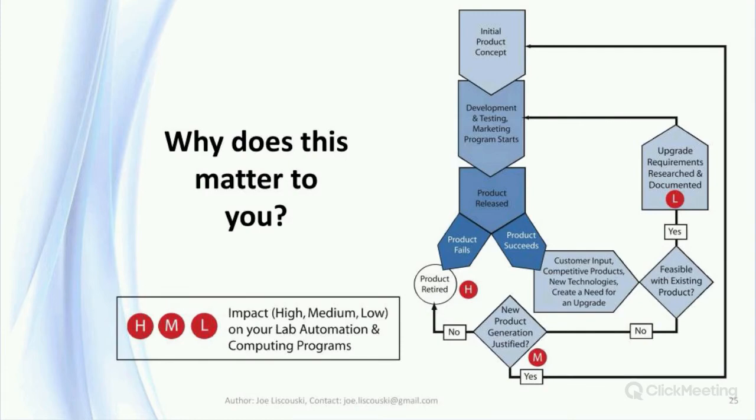These considerations are nothing new. They're points that should have been addressed during the vendor audit phase of the validation process. This received a lot of attention 20 years ago, but I don't know how seriously people are taking it now. The bottom line is simply this. You're going to be spending a lot of resources on developing systems to support your lab operations. If there are critical components, you need to ensure that they are from reliable vendors with a track record of supporting their products and working with their customers.